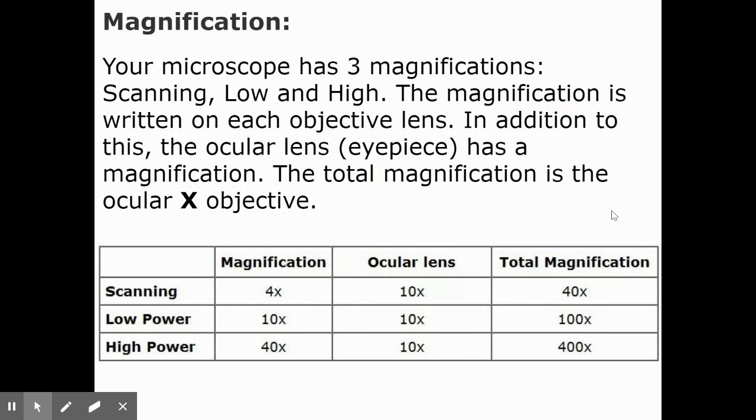All right, magnification. We talked about this a little bit. We're just going to get a little more detail. There's three magnifications: scanning, low, and high.